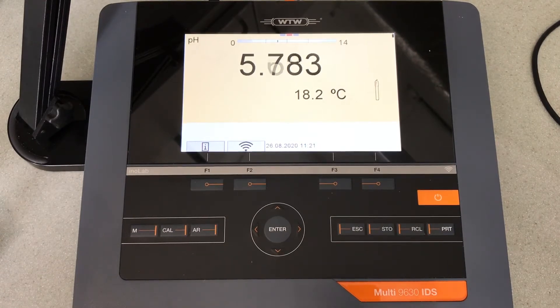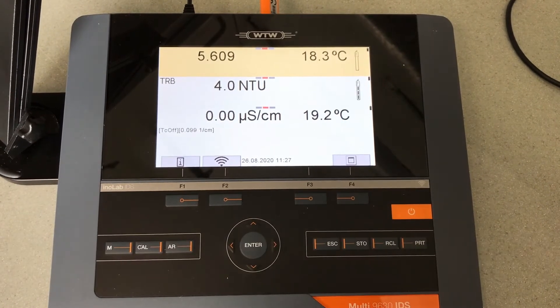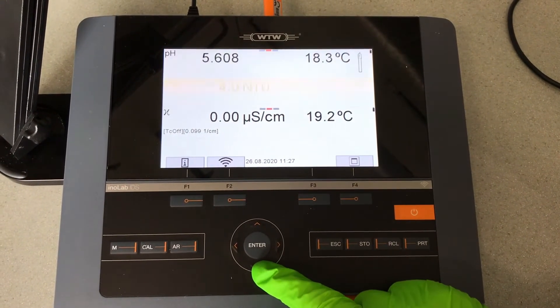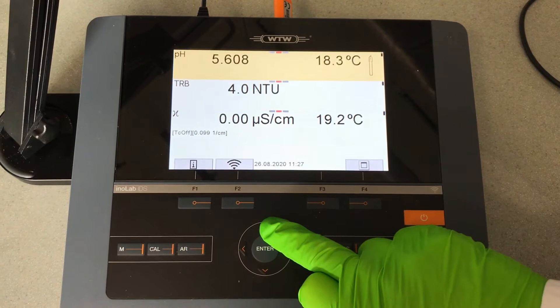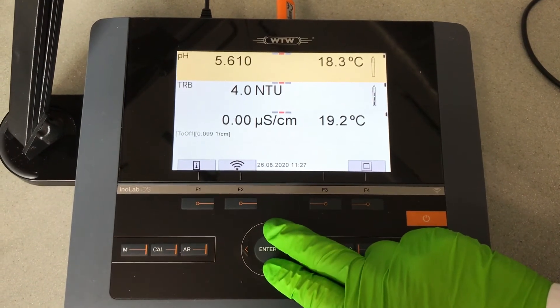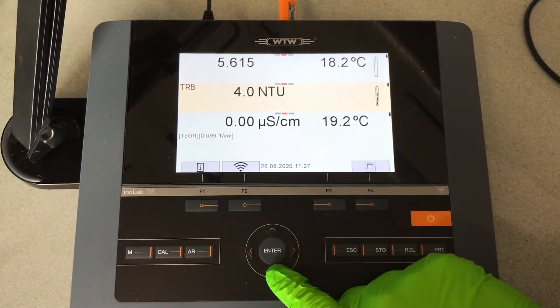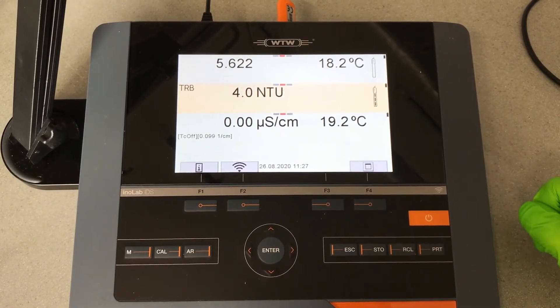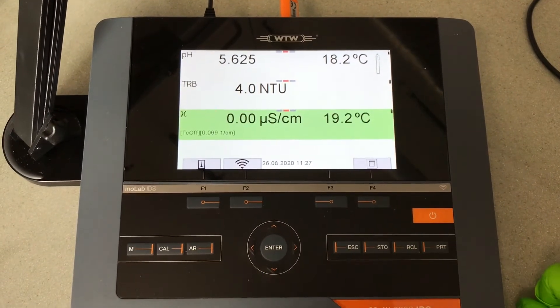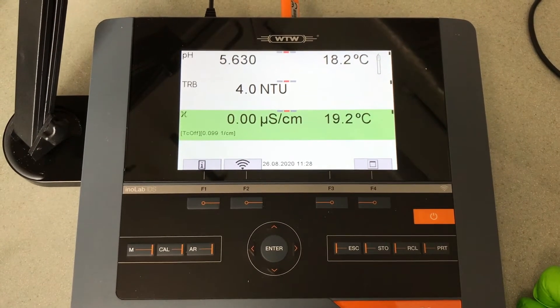The turbidity probe uses around about half that amount of time because it utilizes a lot more power. So now we've connected, in the same way as we did with pH, the turbidity and conductivity probes. You can scroll between these to highlight which probe you want to look at. They're all color coded and those color codes correspond to the colors on the electrodes themselves, which I'll show you in a moment. You can see that the turbidity probe is healthy — it's got three bars — but it's flashing to indicate that it could do with calibration. The conductivity probe doesn't have a calibration bar against it because it's a probe that rarely needs any calibration.